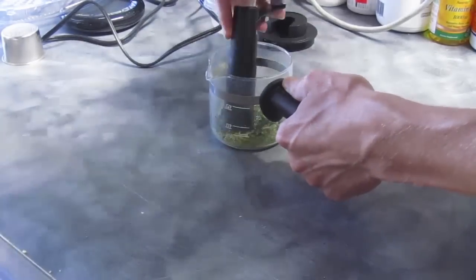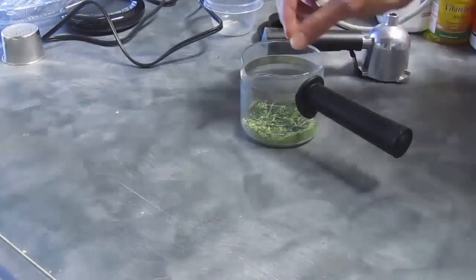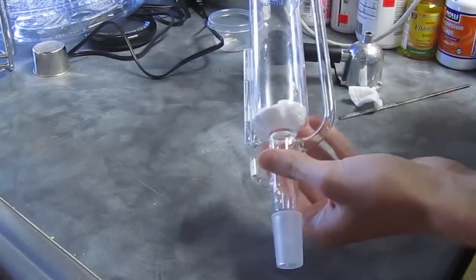Something important: with the capsaicin and the peppers, you don't want them ground up too smooth or else they'll get through the filter and can clog up your siphon.